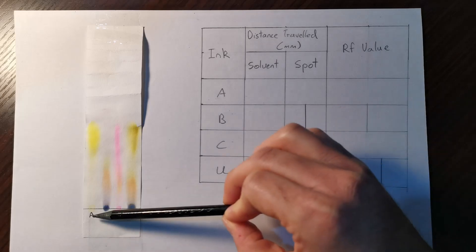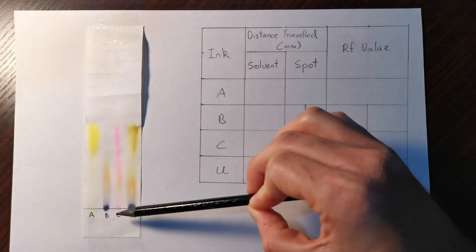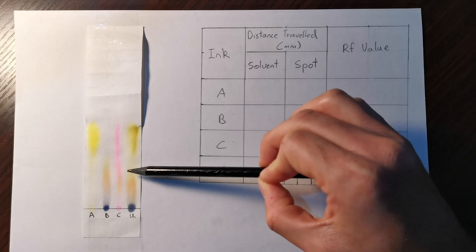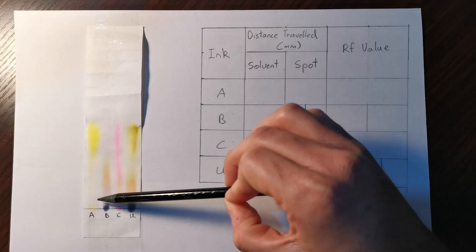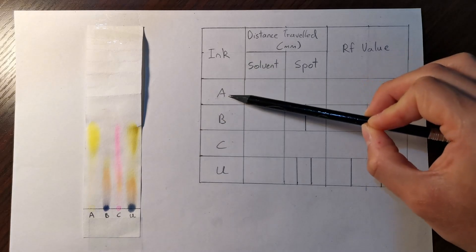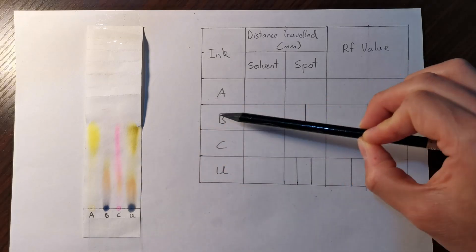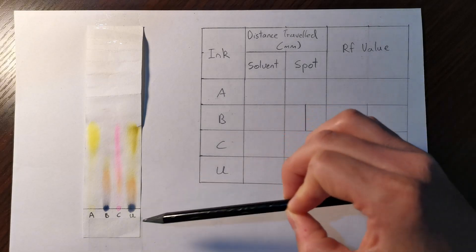We have ink A — the yellow ink — ink B — the black ink — ink C — the red ink — and ink U, which was the unknown mixture of some of these known inks. So in the table, A is yellow, B is black, C is red, and U stands for the unknown mixture.